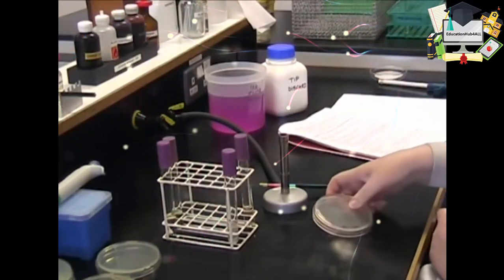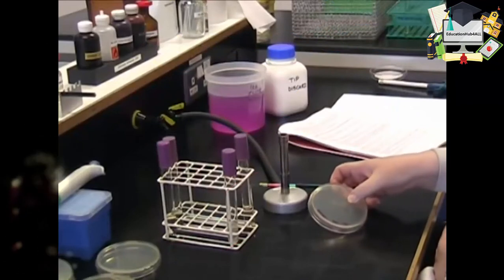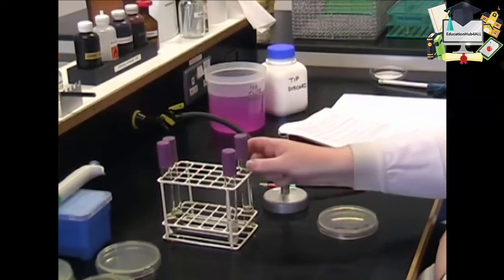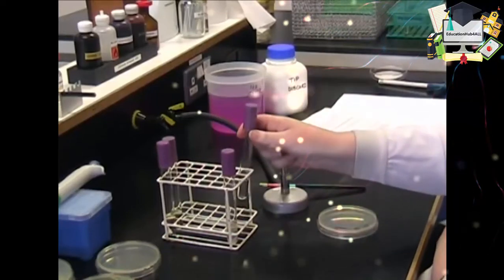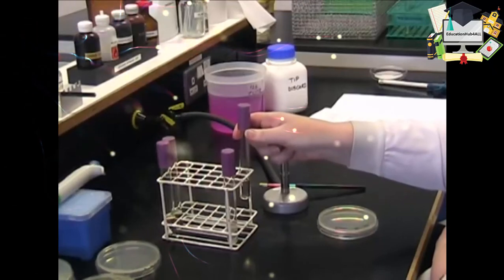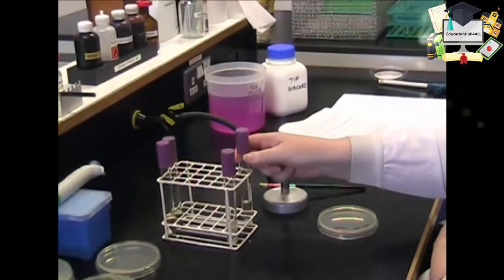Then put this plate ready for incubation in a basket with the appropriate conditions. Also remember to label any tubes, write on the side of the tubes if possible and not on the cap, and put this in the appropriate test tube rack for incubation.